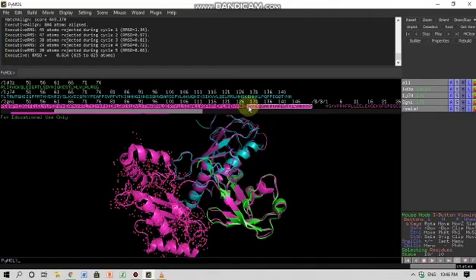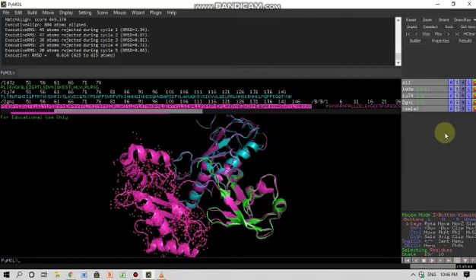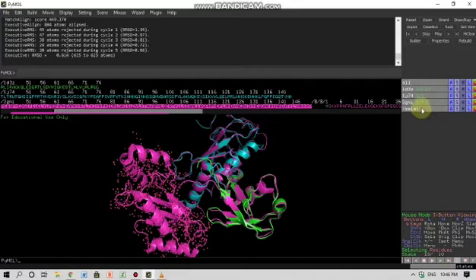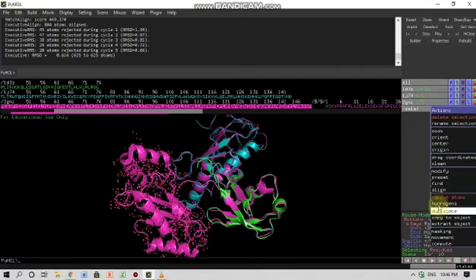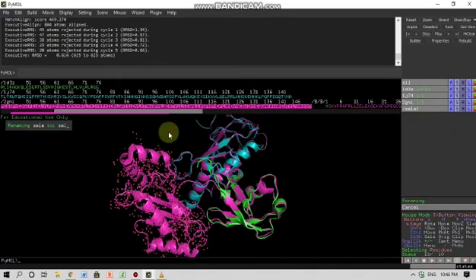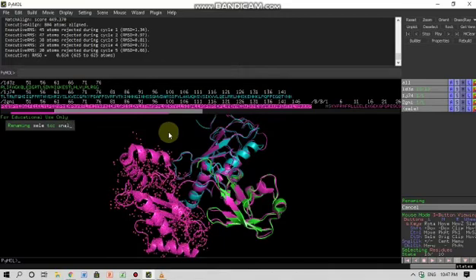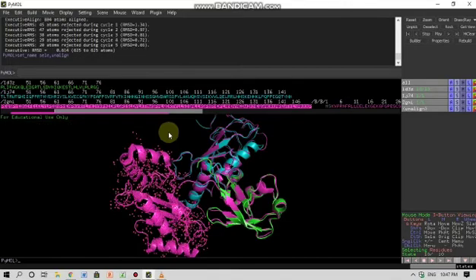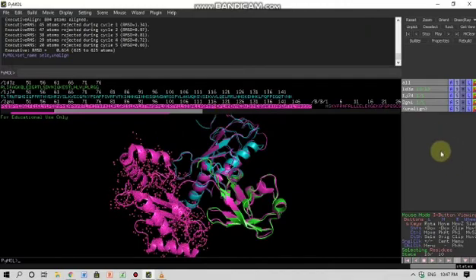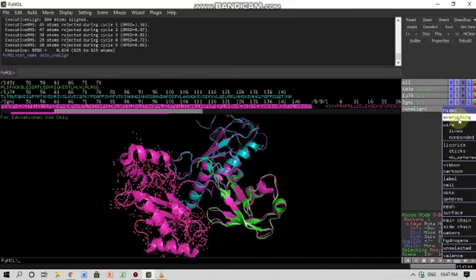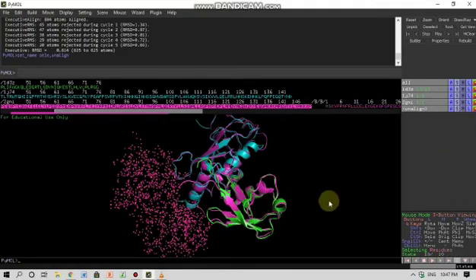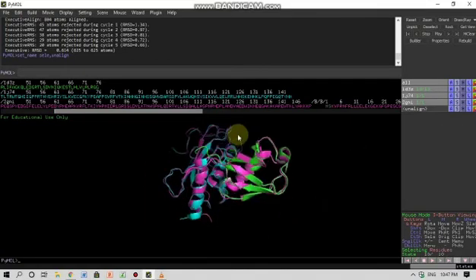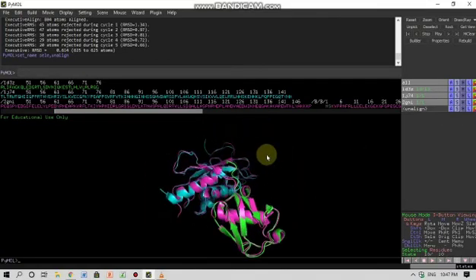So I want to hide all this area. Now I will rename this selection as un-align, and then enter. So I want to hide this. So I will click on hide and I will ask them to hide everything. So now, wow, we are now left with this. These are three proteins superimposed with each other.